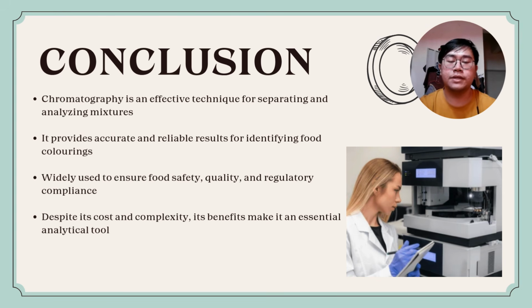Although it has limitations such as high cost and the need for skilled operators, its accuracy and durability make it an essential tool in chemistry and many other industries.